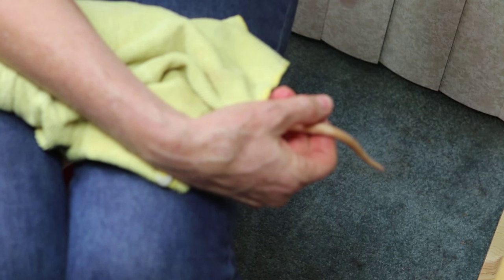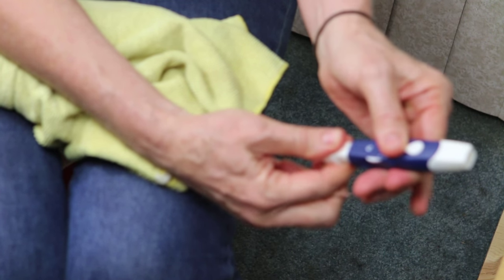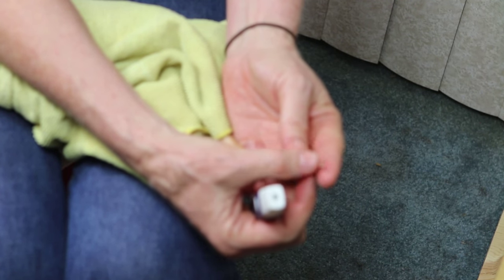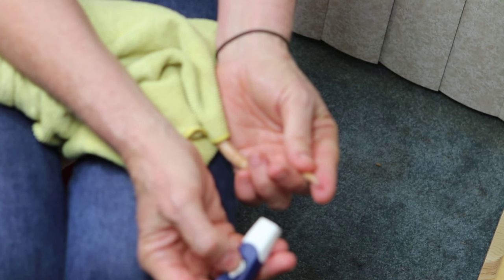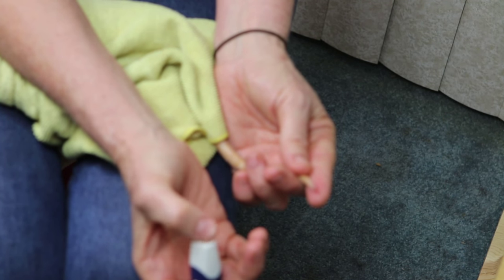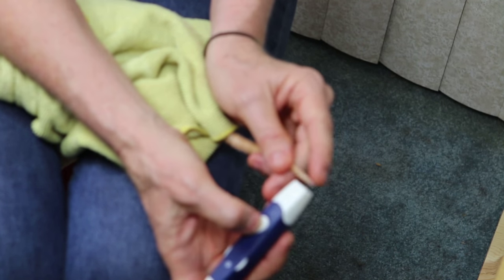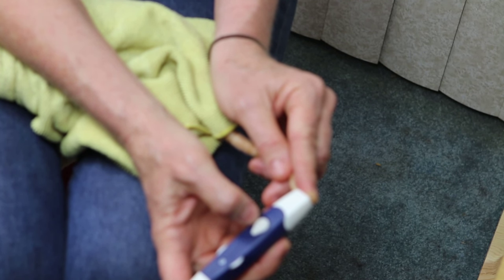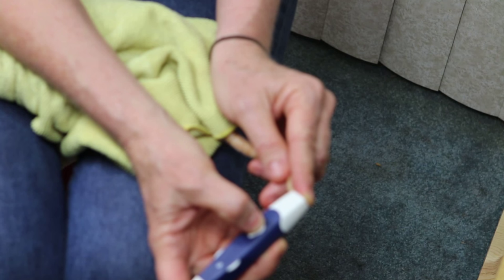The first thing I need to do is grab my lancing device. Here's the hole where the needle is going to come out. I've already cocked it back — it's ready to go on the deepest setting. I'm going to place just the tip of his tail against my pointer finger. This right here is the button I'm going to be pushing when I'm ready. His tail is on top of my fingertip. I look at the hole, line it up, and press it firmly. His tail is like the sandwich meat inside of a sandwich — I have my finger on one side, his tail, and then the lancing device. Then I push the button.